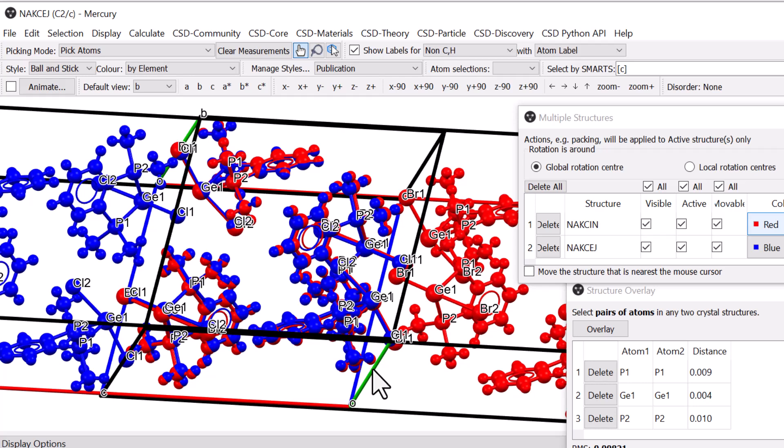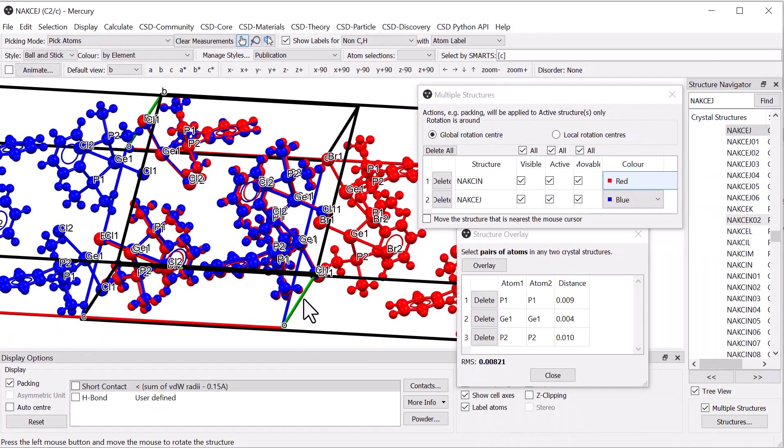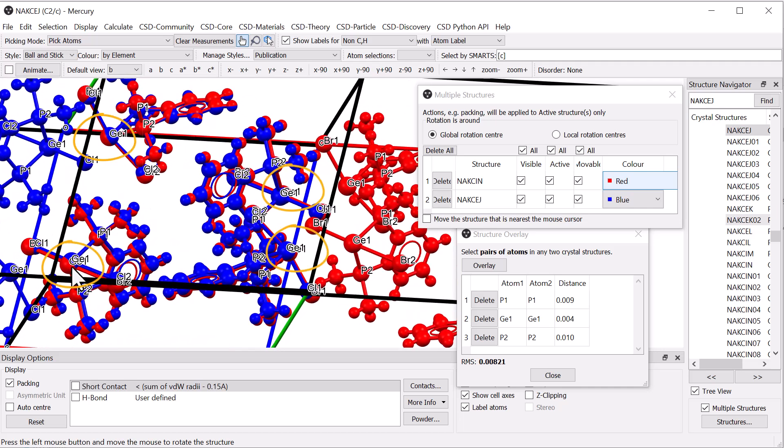You can explore the tool further using this example. Try deleting the currently overlaid atoms from the Structure Overlay table and instead use all pair of germanium atoms that are currently close to one another in the Overlaid Packing view. See what happens to the RMS value when you do this.